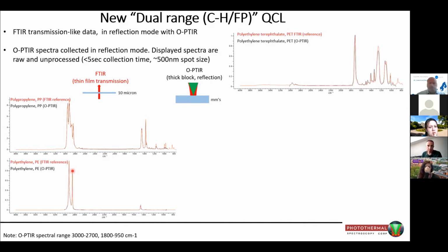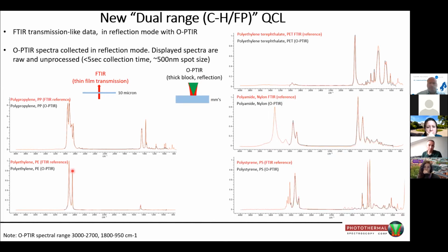Polyethylene, the same, PET, nylon, and polystyrene. So it's actually phenomenal how good the two techniques match. Which just means that anything you've got already with FTIR, be it commercial libraries, be it data that you've collected yourself, it's fully equivalent and comparable to anything you collect on O-PTIR.